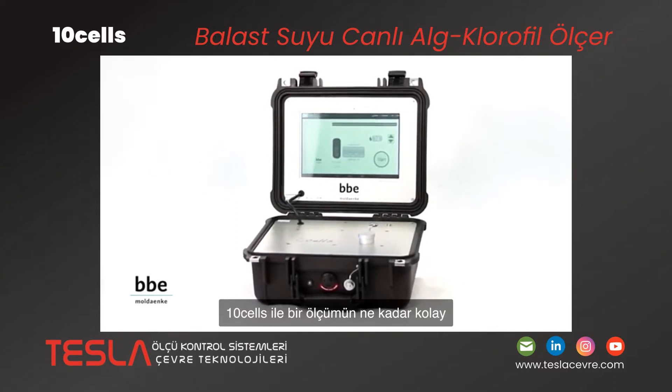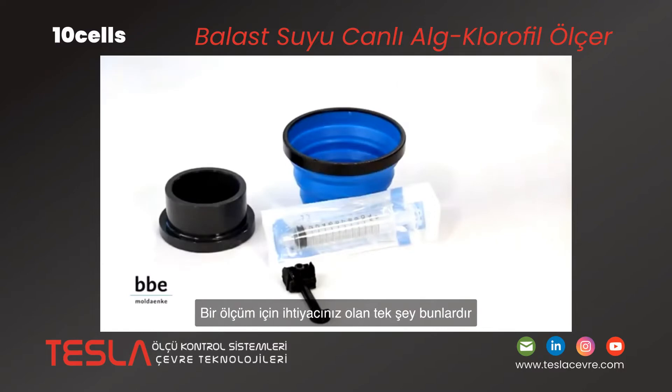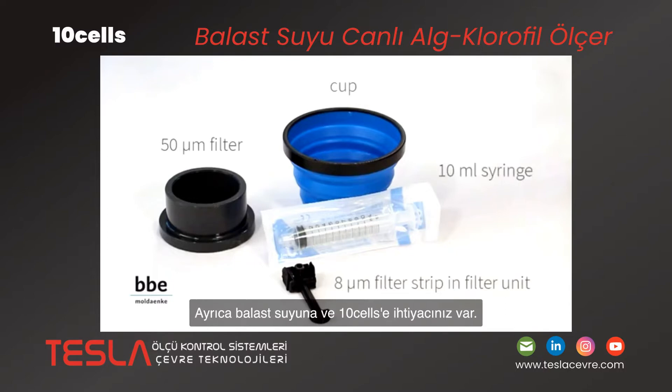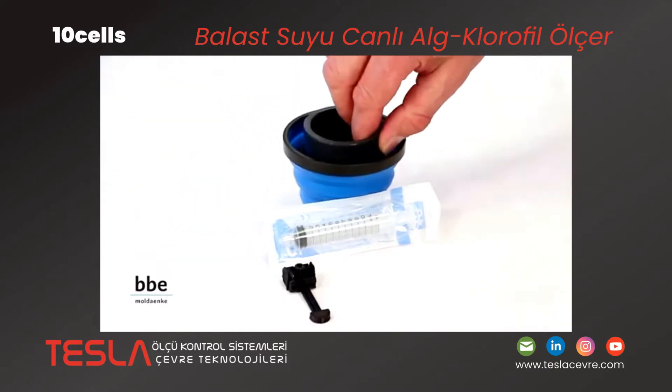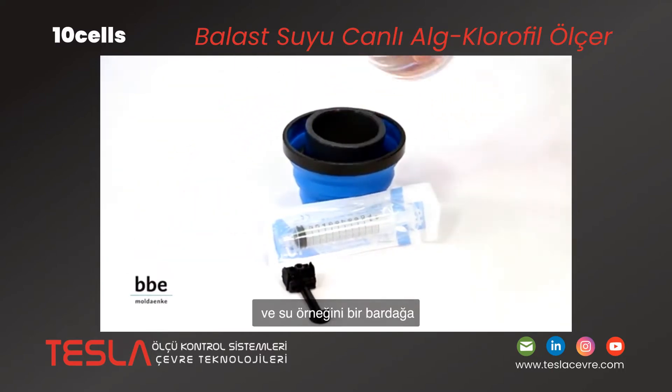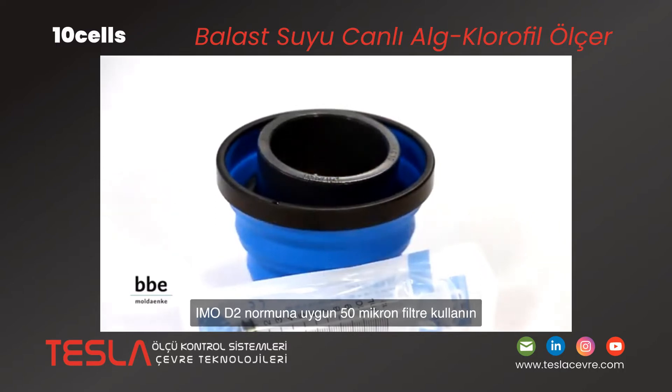Let's see how easily a measurement with TenCells can be performed. This is all you need for a measurement — of course you also need a ballast water sample and a TenCells device. To start, take the ballast water sample and pre-filter the water sample into a cup. Use a 50 micron filter in accordance with the IMO-D2 norm.